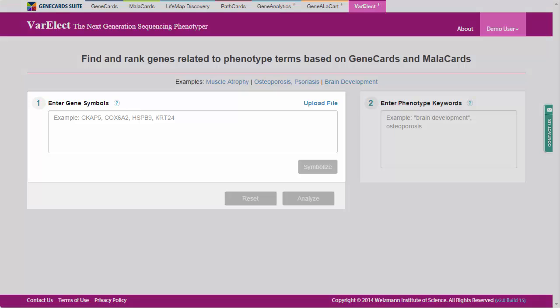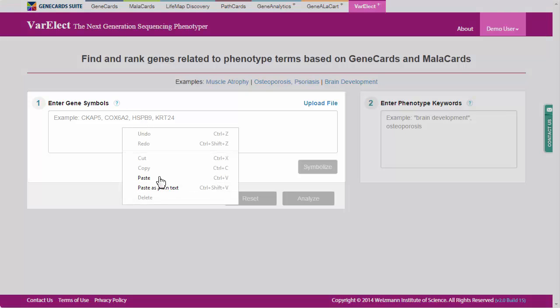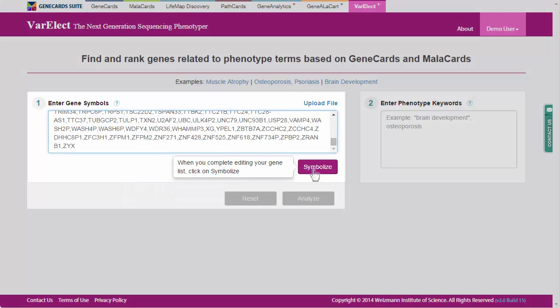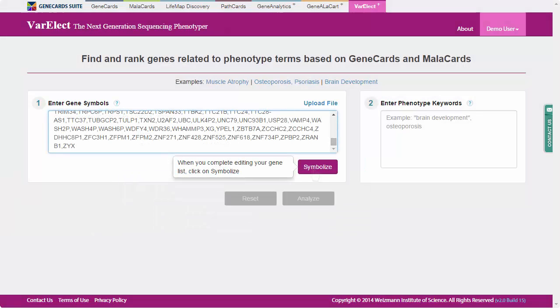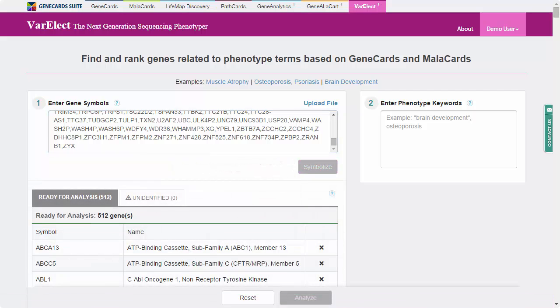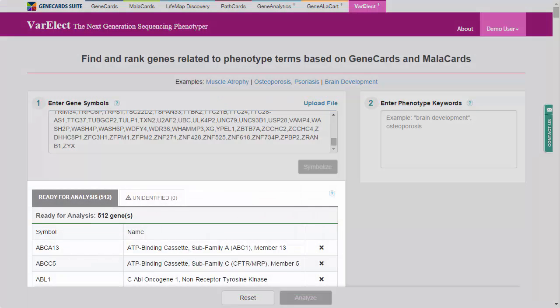Let's start by pasting the list of genes into the box on the left and click Symbolize. Varelect now validates the list of genes. As we can see, all gene names were identified. We can resolve unidentified gene names using the Unidentified tab.